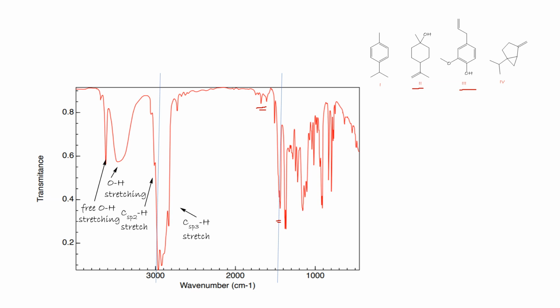It's not multiple peaks, but just a sharp peak, which means that most likely the structure will be this one. Keep in mind that we have to watch for the other one and compare later on.